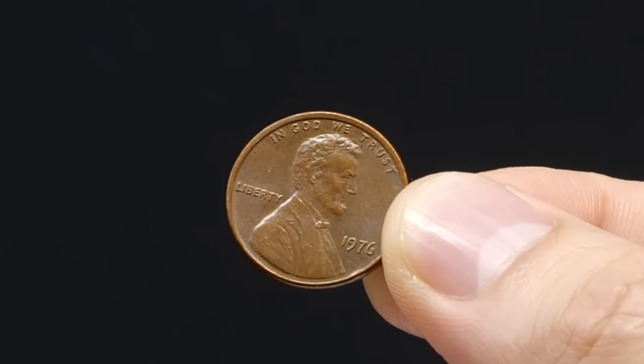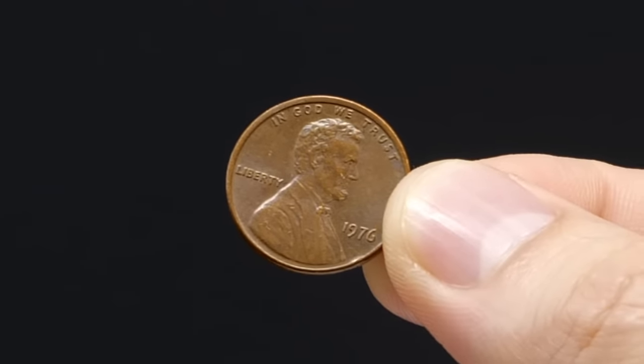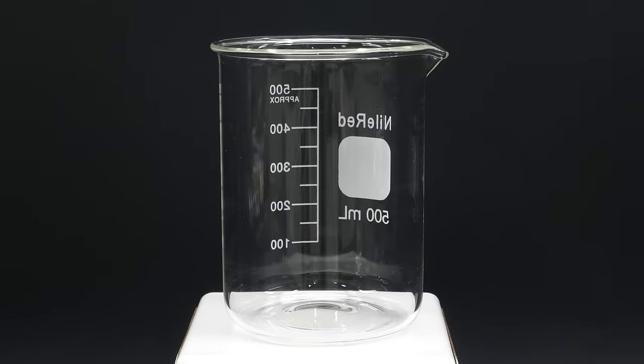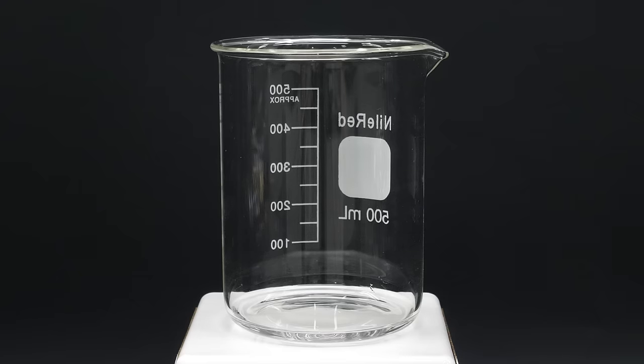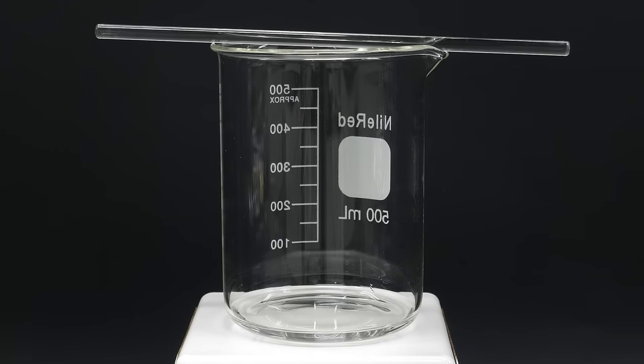Today, I'm going to be turning a penny into a lightbulb. The first step is to get a beaker and add some acetone. I'll also put a glass rod on top of it, and that's it for this part.